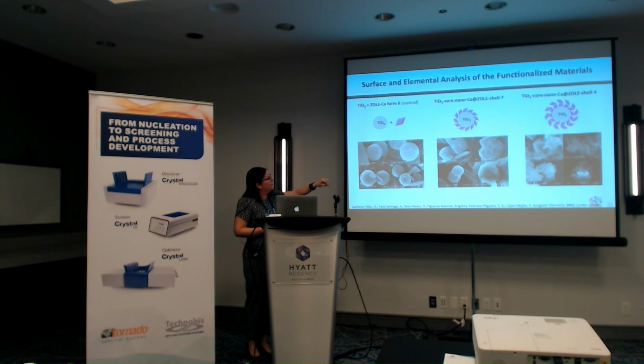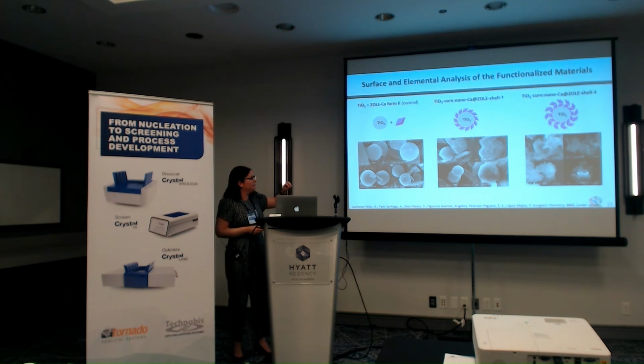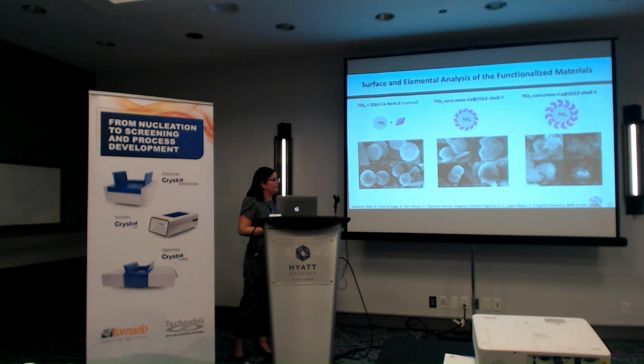The first TiO2 core nano salt shell, which only lasted for 5 minutes of surface crystallization, and the TiO2 core nano salt shell that lasted 15 minutes. And as you can see, at 15 minutes we have overgrowth of the crystals. So probably in terms of applications, we're gonna go with the 5 minute surface crystallization.